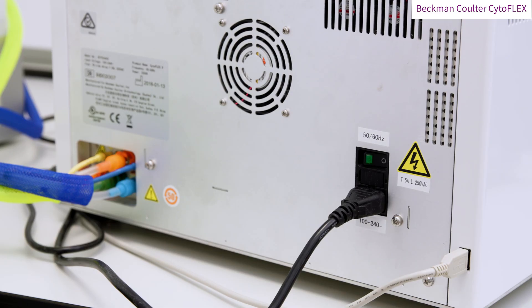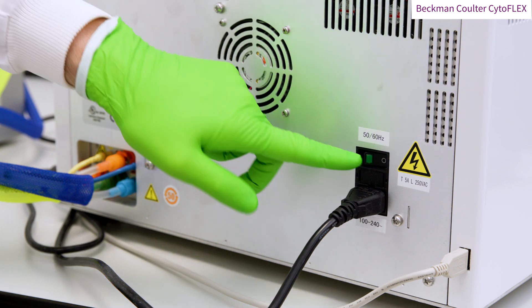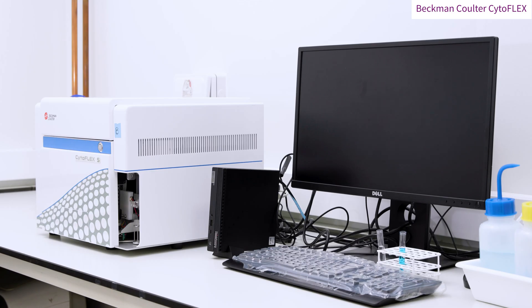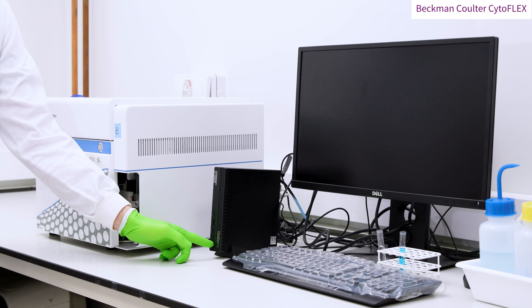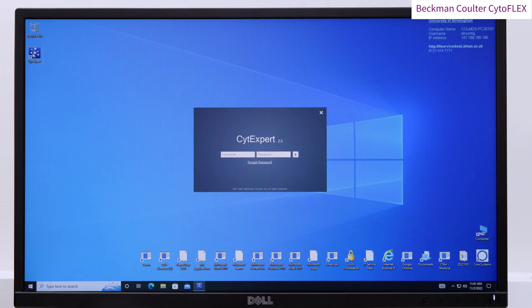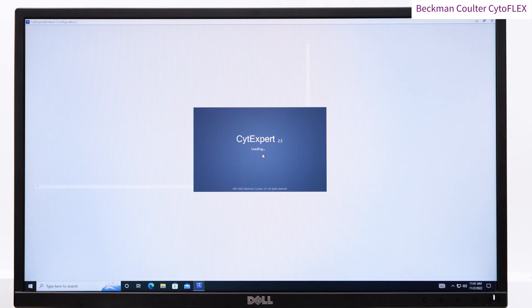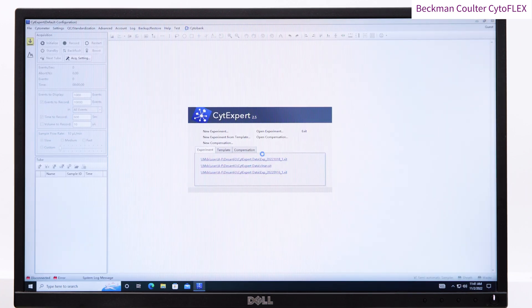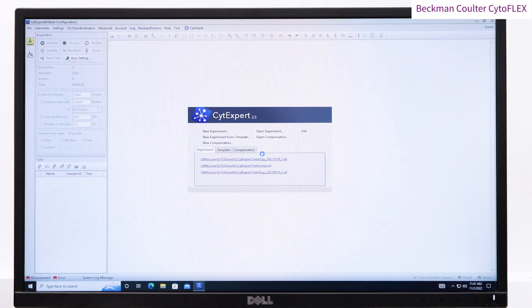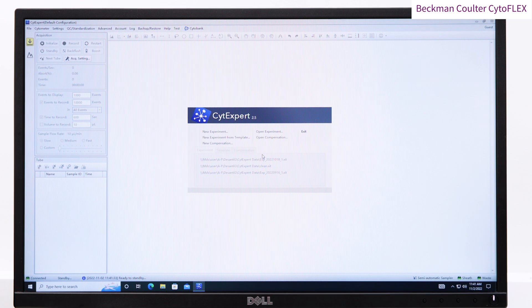Turn on the machine by pressing the button located at the rear of the machine. Turn on the PC and launch the CytoExpert software and log in. Run the system startup program and follow the on-screen prompts to first initialize and then run a tube of deionized water.